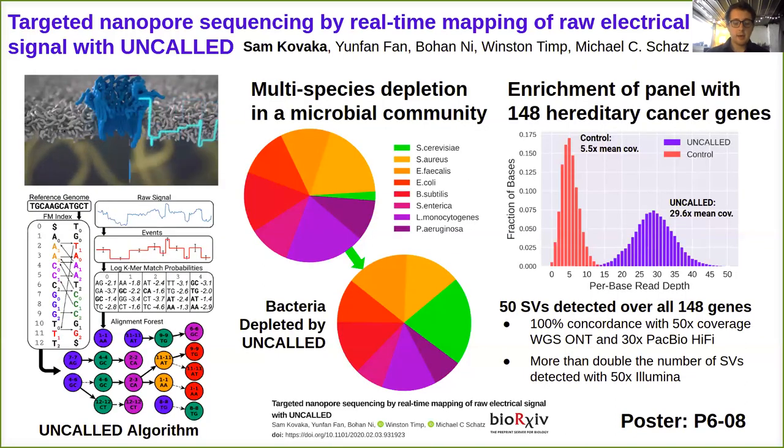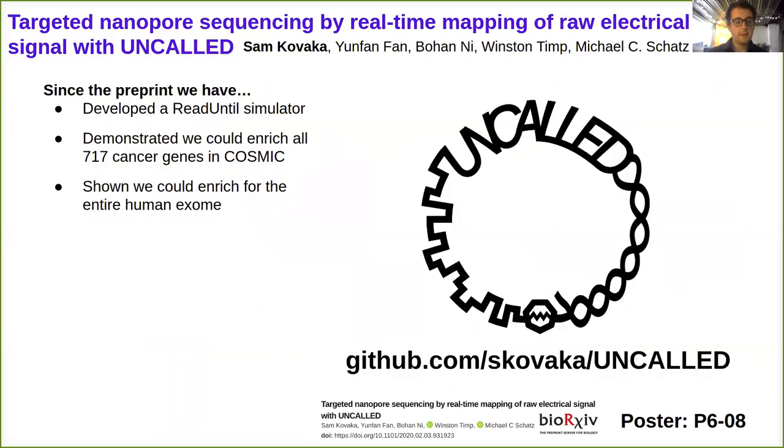We posted this preprint on bioRxiv back in February, which you can check out. Since then, we've been doing more work, namely we've developed a simulator which can accurately simulate a real-time nanopore run and properly handle read-until ejections to predict how much enrichment Uncalled could enable under certain scenarios. This is really helpful, especially now when we don't have access to a real lab.